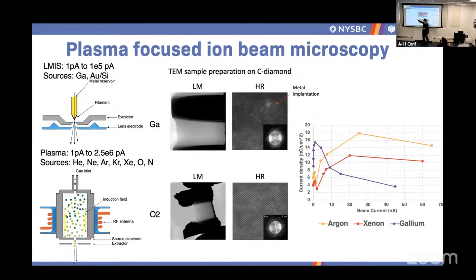If you have a plasma FIB, it will not be optimal in the lower end because your source is very large, your orifice is very big, but then the current density improves up to a point where it stays fairly stable, and it will stay stable up to multiple tens of nanoamps, if not hundreds, which essentially means that you can mill faster because you have many ions in a very small spot size.